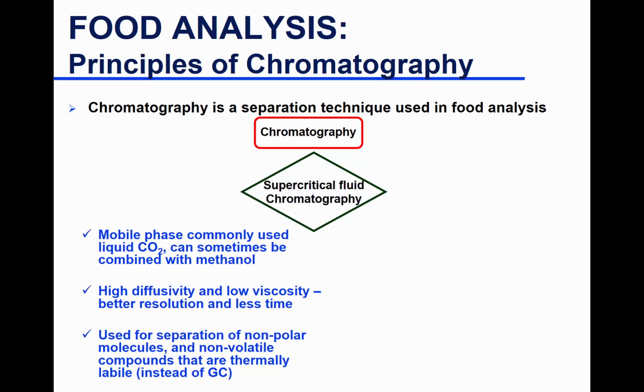Okay, so the other type that I'm going to talk about, so we talked about GC briefly, liquid chromatography column, planar and column briefly. I just want to introduce supercritical fluid before going into different modes of separation, going back and focusing more on liquid chromatography.